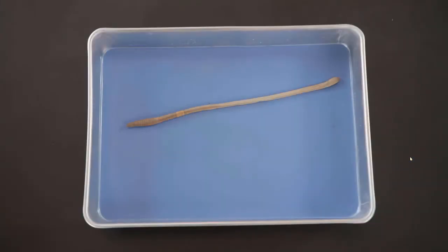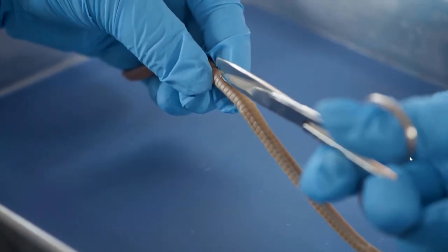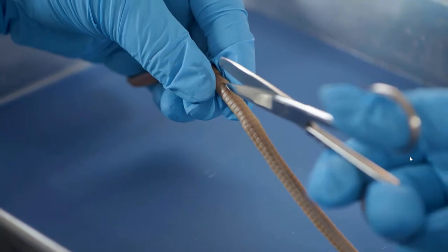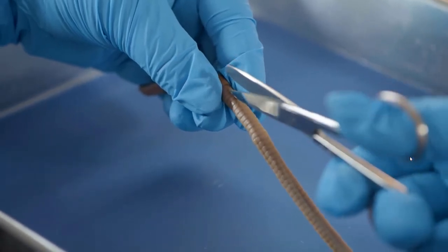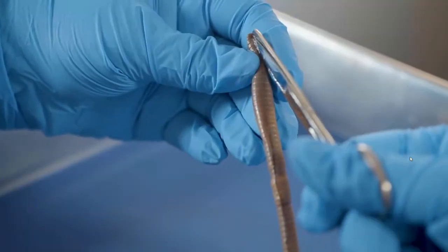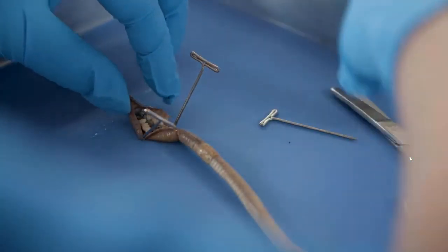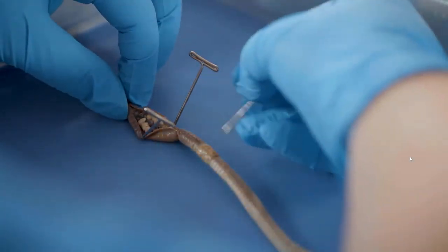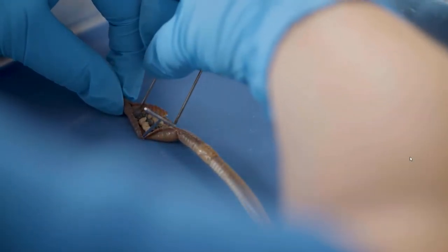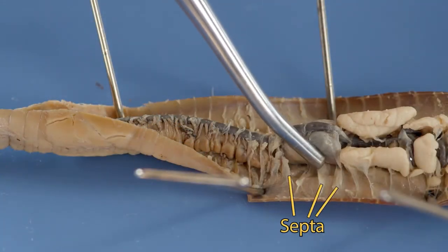Let's move on to the internal anatomy of the earthworm. Place the earthworm in the dissecting pan, ventral side down. Gently pierce the dorsal wall with the scissors, just posterior to the clitellum. Continue cutting the dorsal body wall until you reach the mouth. Pin the body wall to the pan. You may have to cut away the tissue between the segments to do this. These thin walls separating the segments are called septa.